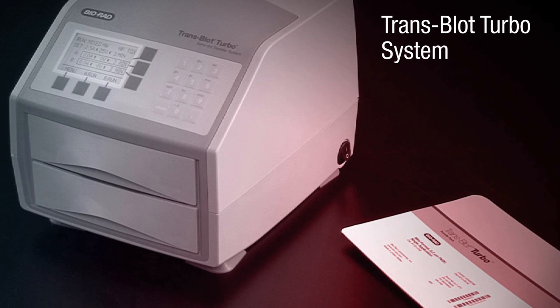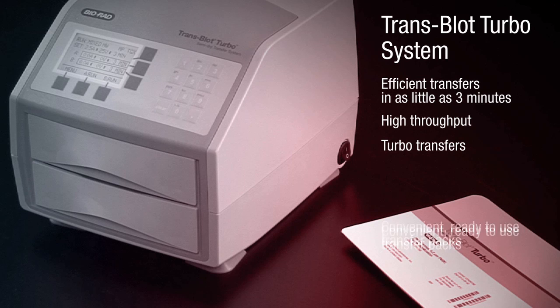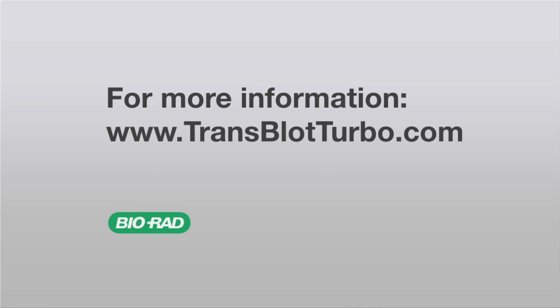BioRad's new Trans-Blot Turbo blotting system provides fast and efficient transfers in as little as three minutes. By combining high throughput with short run times using our convenient ready-to-use transfer packs, the assembly process is further streamlined, reducing the time required for traditional transfer techniques. For more information on the Trans-Blot Turbo, please visit www.transblotturbo.com. Thank you.